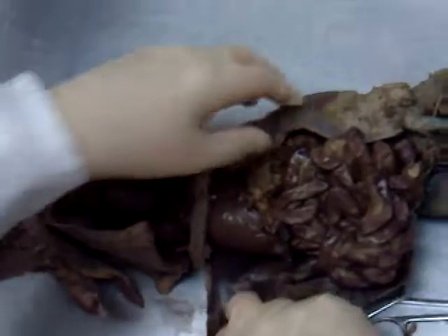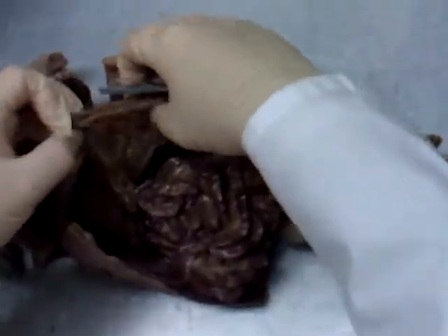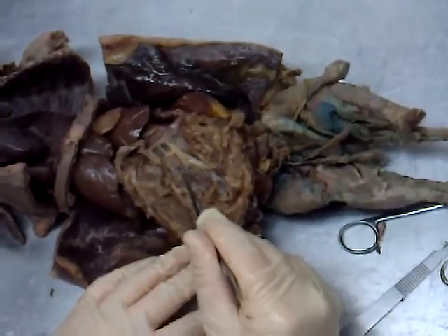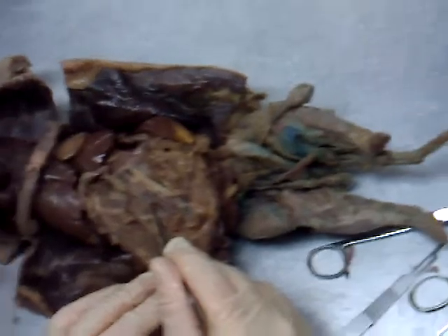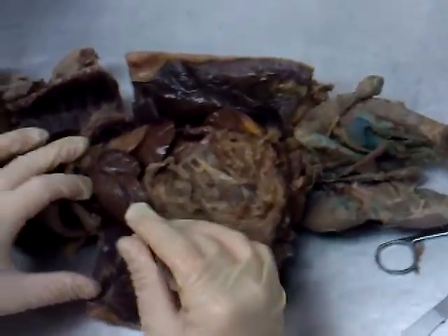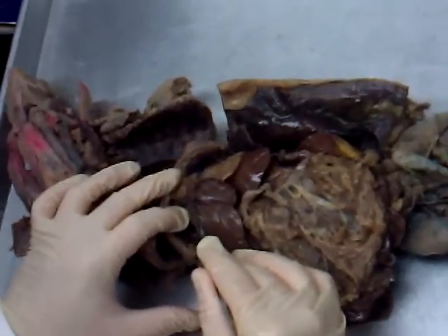Down here in the abdominal region now — let's open this up. First, this big membrane coming out of the intestines — we call this the greater omentum. Then this huge organ right in here: liver. Hidden amongst the right lobes of the liver, this deflated sac here is the gallbladder.